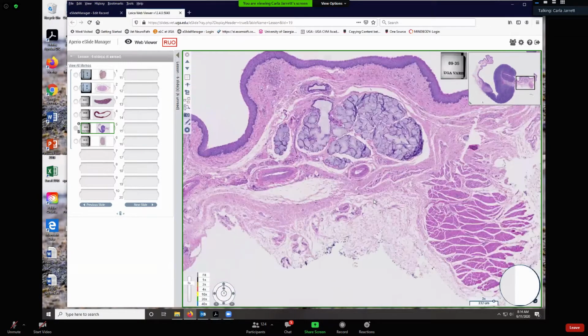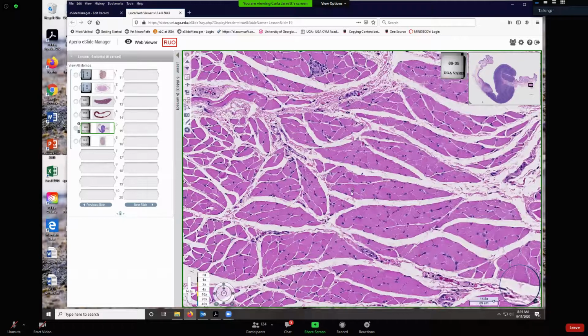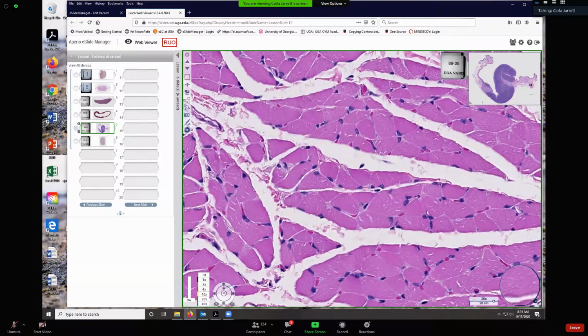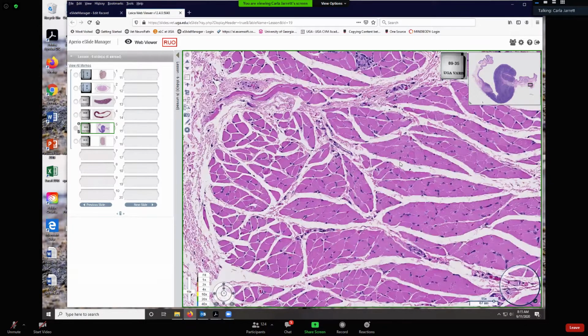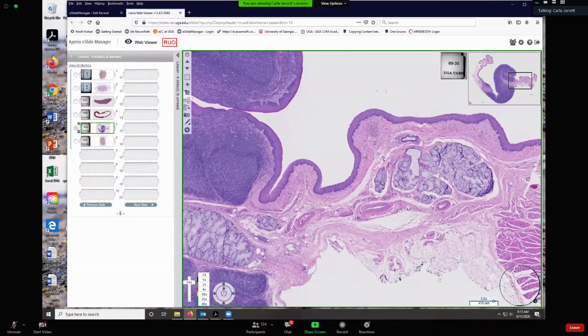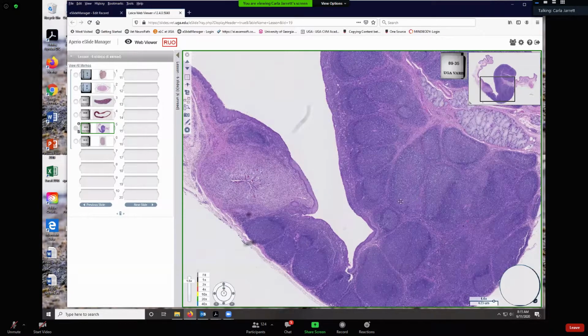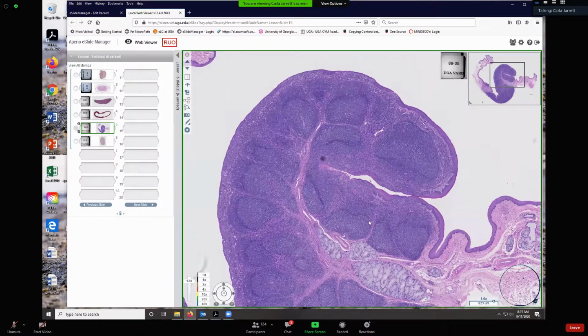Also, you might see some skeletal muscle, and these would be pharyngeal swallowing muscles here, which we'll learn about in gross anatomy. And this is skeletal muscle. You can see those peripherally located nuclei. You can see the little triangular shaped myofibers and the stippling of the myofibrils inside the cell. Okay, so that's accessory extra information to help you identify the tonsil, but really all you need is diffuse and nodular lymphoid tissue capped with stratified squamous epithelium.